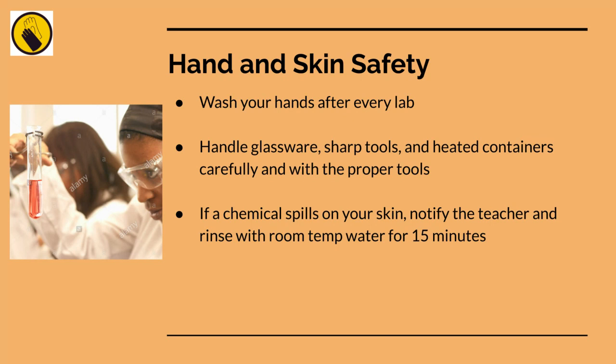There are videos you should watch and some demos. You'll see people using proper materials in order to pick things up. In the picture on this slide, there's a lady holding up a test tube with some tongs. This is good practice because it's possible that she just heated that up, and you really don't want to touch hot glass. If you are working with other hot materials and you have to pick it up with your hand because there are no tongs, there are gloves that you can use.